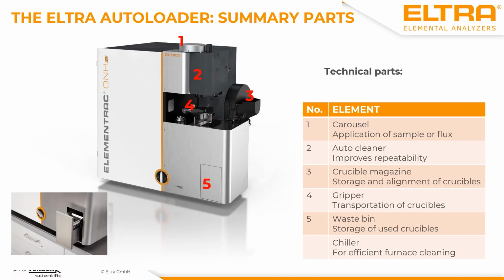It's here marked with number 5. You can just press it there, and then you can put all the used crucibles into the waste. One other thing which is also not shown in the video is a chiller, which is recommended for most of the applications, and this is something I will explain on the next slide.